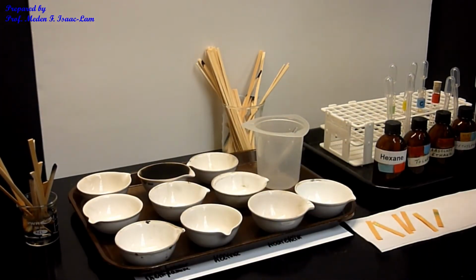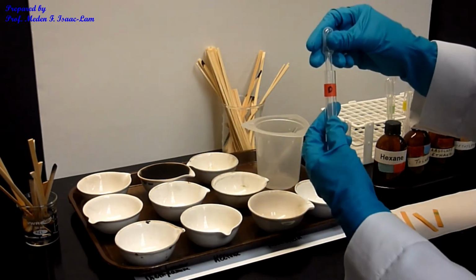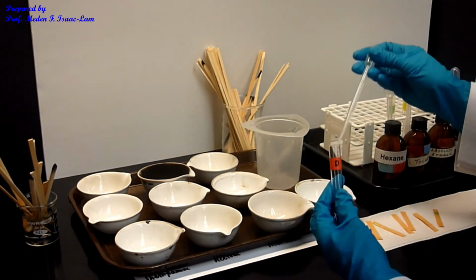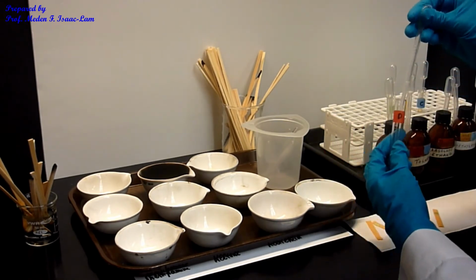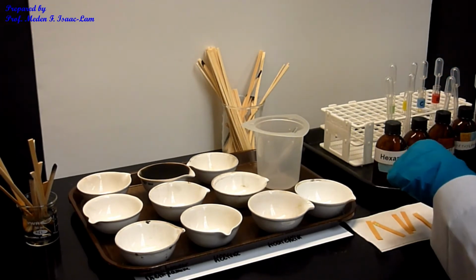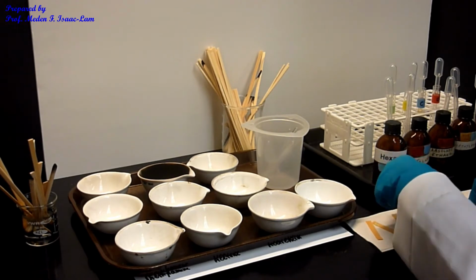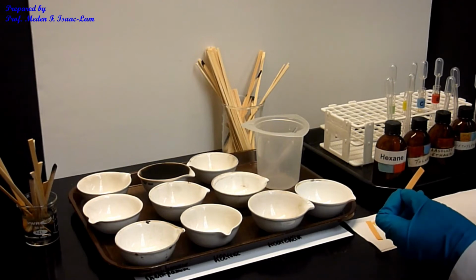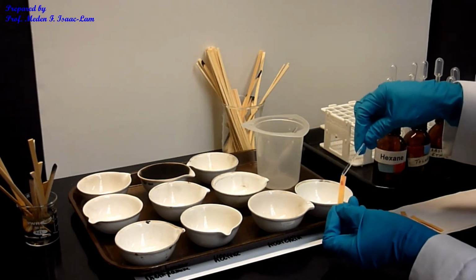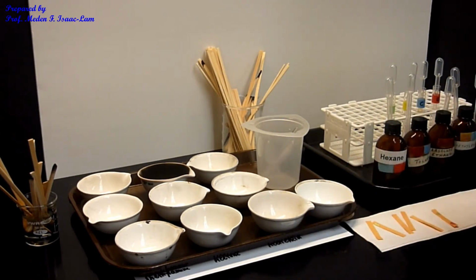And then the last one is gonna be D, unknown D over here. So again, few drops. Okay, and then acidity, so we can use the other end of this one. Okay, it's red, so you can probably guess what it is, right?